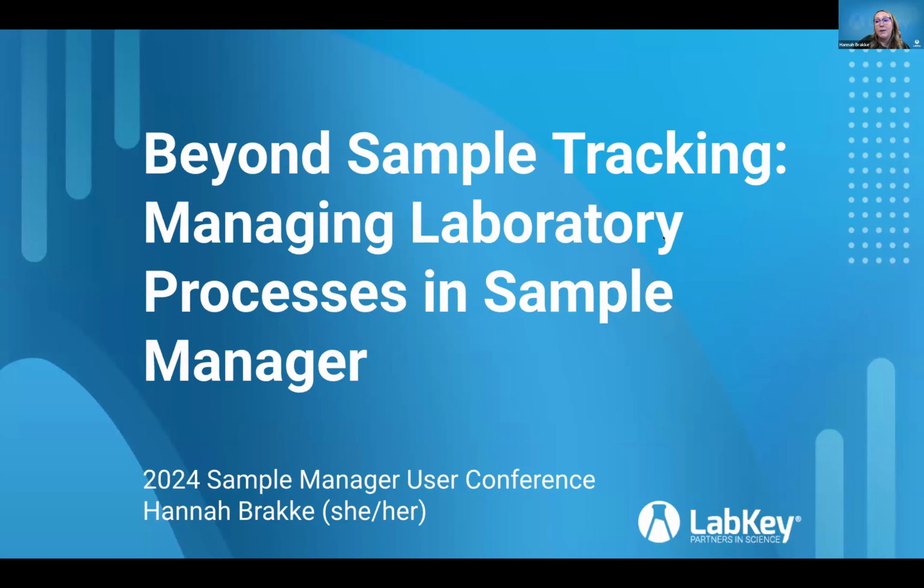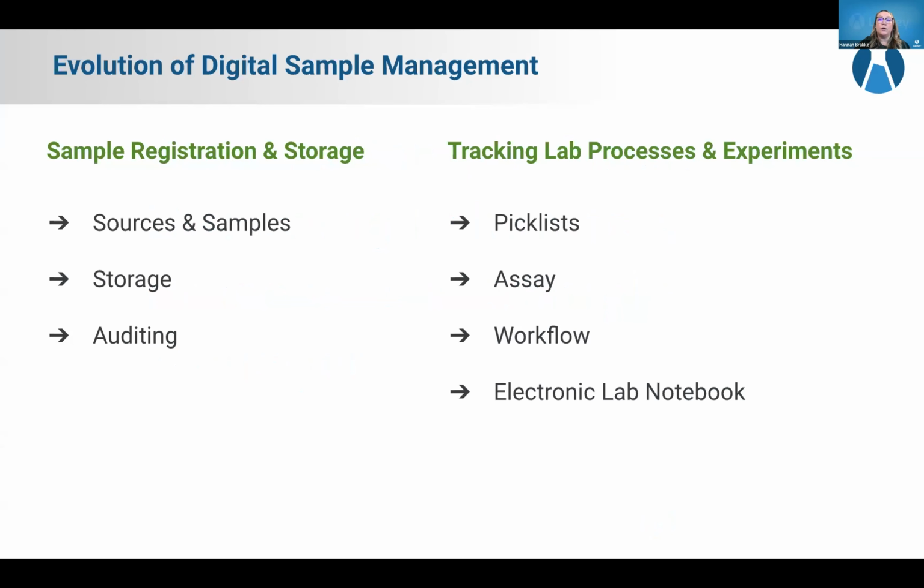So really what I'm going to be talking about is that beyond sample tracking component and being able to manage laboratory processes or experiments within the Sample Manager tool. And we've heard this a lot from a lot of the speakers today, but there is a piece of evolution that happens when you start to manage your samples digitally. And there are those core processes that we've talked about, the sample registration and storage, as well as the auditing and lineage component, again, being able to understand where the sample came from.